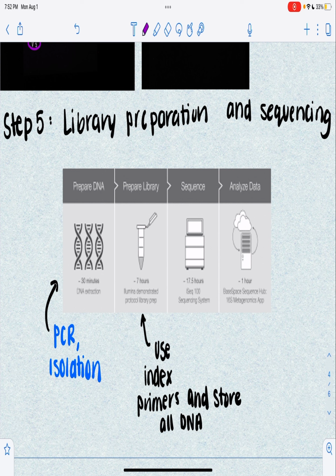Using those sequences, we compare with our sequences that we got from our samples and are able to identify the specific type of bacteria or organism that might be present in the water.